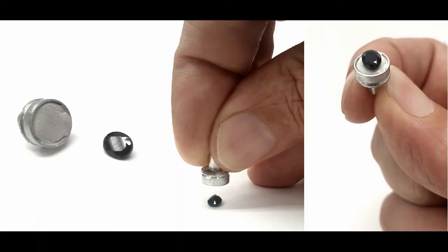Identification of black stones is often complicated with traditional gemological tests, especially when they are small. This sample is not flat, so we need another stage to position it to expose the table for reflecting the beam. This accessory keeps the sample in place by blue tack and can accommodate even stones of big dimensions. Let's insert the sample stage with the stone in the sample chamber.